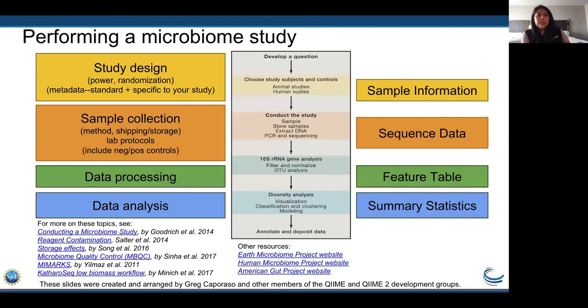Now I'm going to switch from the infrastructure, where we run all the computational analysis, and take a step back to re-highlight where QIIME 2 comes into a microbiome study. For those of you on the study design side, you collect your samples and metadata, then send the genomic DNA to your sequencing center. They, or you, may add the barcodes or adapters for sequencing. Then they'll sequence either your amplicon or the ITS region, whichever your microbiome sequencing is doing, and you'll get your output reads. This is where data processing comes in: how do you find out what's in your sequence samples? In this schematic, the downstream part for your data processing and data analysis is where you can use tools like QIIME 2.